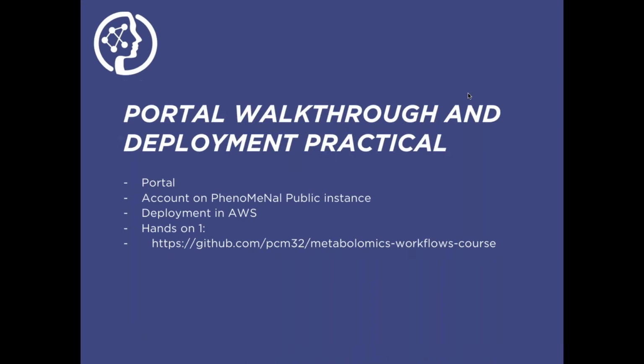So now I will start with the portal walkthrough and deployment practical. I will show what the portal is. I will show you how to get an account on the PhenoMeNal public instance. I will show a deployment on Amazon Web Services. And all of the steps that I will follow are part of hands-on number 1 at the address that you have here.